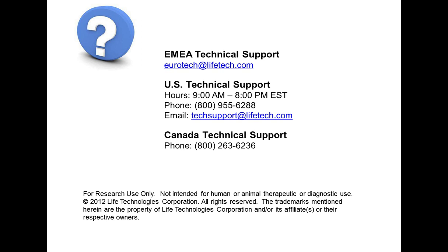There's a question about interference when using a strong and a weak signal. I'm assuming this means in different channels or using different fluorophores, and there can be bleed through from one channel into the other. There is a way of helping to define your experimental design so that you pair your weak fluorophores with your strong markers, and that's something that we'll cover again next time.